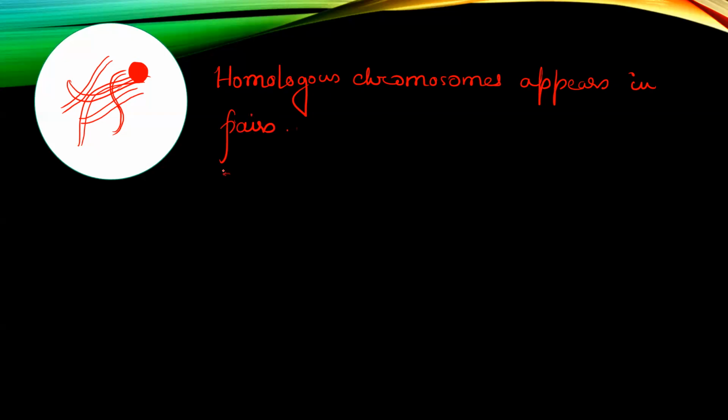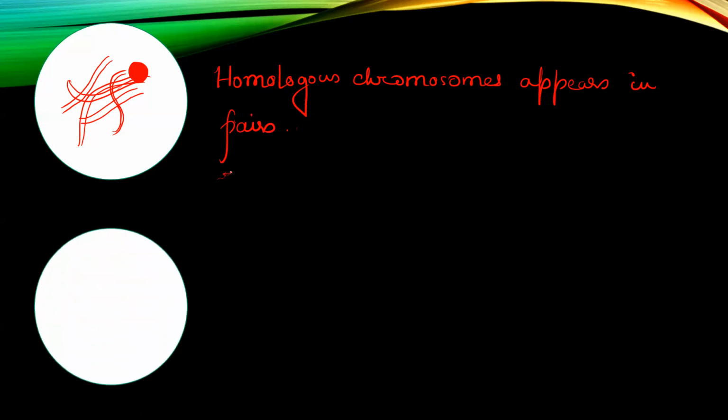Correct? Next, what do we have? Next stage is the pachytene substage of prophase 1. So this one is zygotene. Next, we have the pachytene substage.